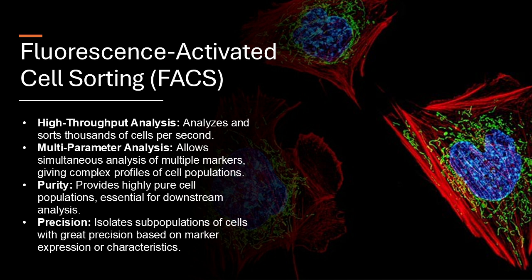FACS is essential for identifying and isolating cancer cells from complex tissue samples, right? Right. This allows scientists to study their properties and to test different drugs. It's also being used to develop those personalized cancer therapies, by identifying specific markers on tumor cells that can be targeted with drugs or immunotherapies. That's incredible. And it sounds like FACS is giving researchers a way more precise way to target cancer cells. Yeah. Which could mean better treatments with fewer side effects.